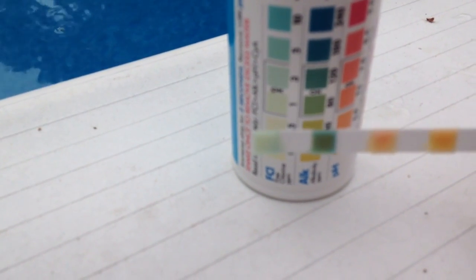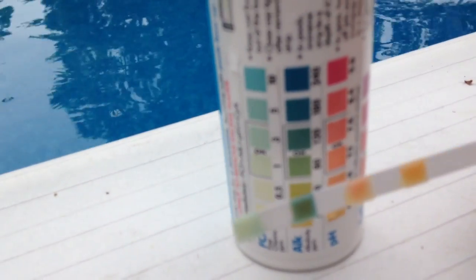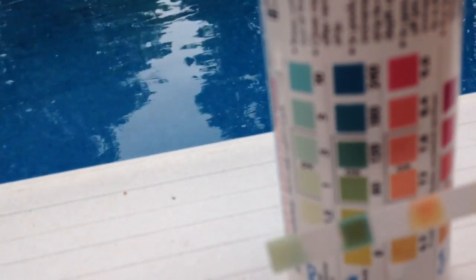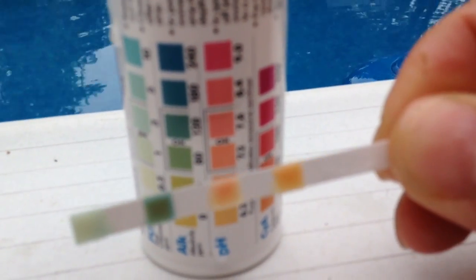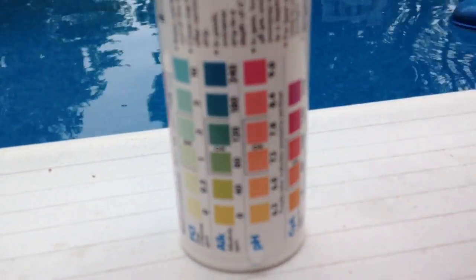You want to hold it up to the range. In this reading my chlorine looks to be right on. The alkalinity is right where it should be. And the pH looks pretty good too — I could probably throw a teeny bit more in there but it looks pretty decent.